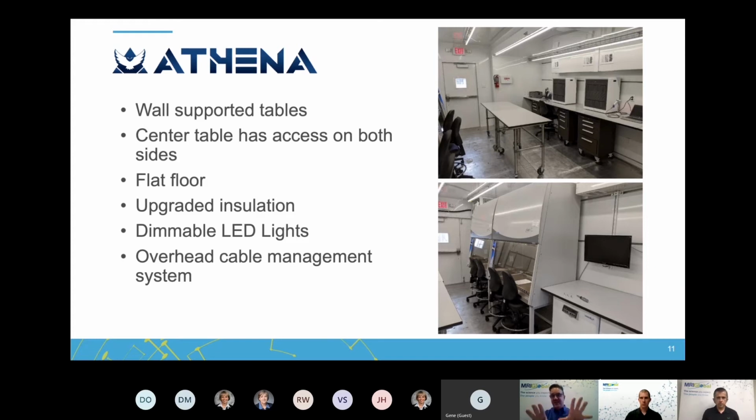So you can see in this example, they wanted to have 2 BSCs. Their workflow for the diagnostics called for 2 BSCs and 2 16-bay GeneXpert modules for doing the diagnostics. In that upper picture, those are the 2 16-bay GeneXpert modules. And in the lower picture, which would also be to the left of the upper picture, you can see the 2 integrated BSCs that they're using in this workflow. But this is just based on the DoD's workflow that they defined for their analysis.